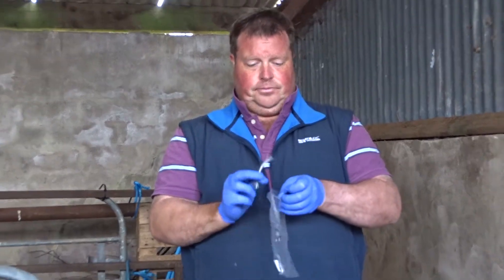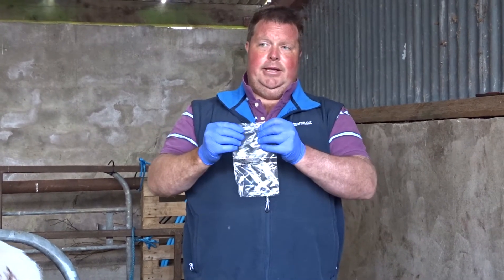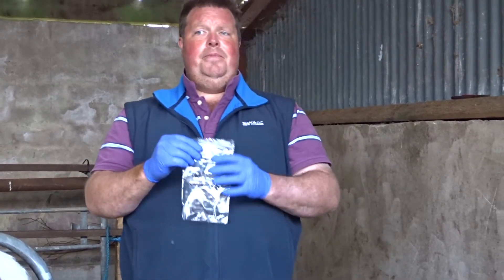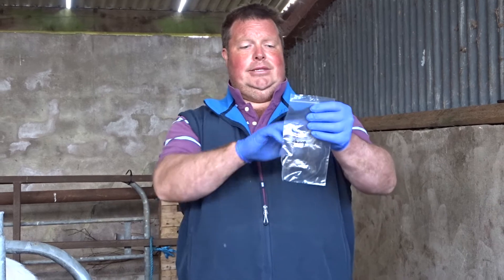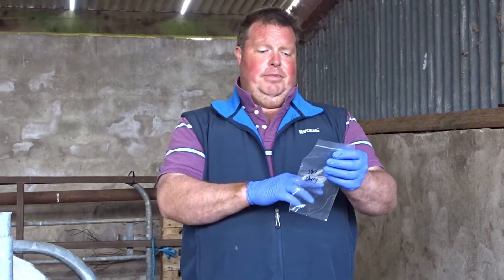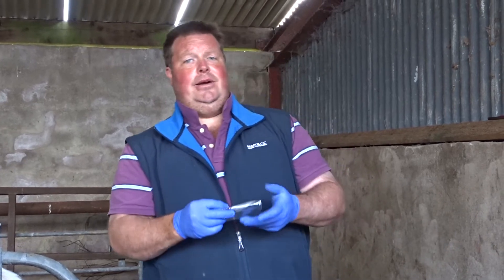Pop that in there. What happens then is I go into the house and write the label. I don't stick the label on before coming out because I want to keep the label clean. So I go into the house, write the label, then stick the label on — it's nice and clean to be posted off to the secretary along with payment. The people in the laboratory and the secretary can read it nice and clean, clearly.